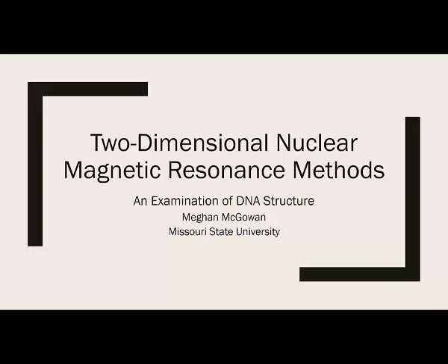My name is McGowanM, and this lecture capture video is about two-dimensional nuclear magnetic resonance methods and how those methods can be used to examine a DNA structure. We're going to start with a little overview here.